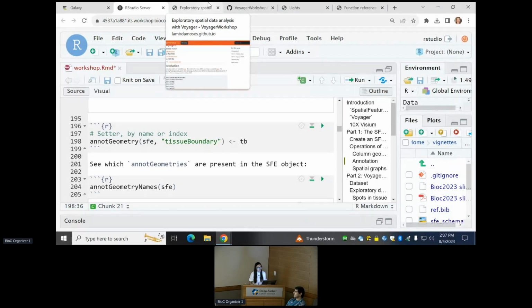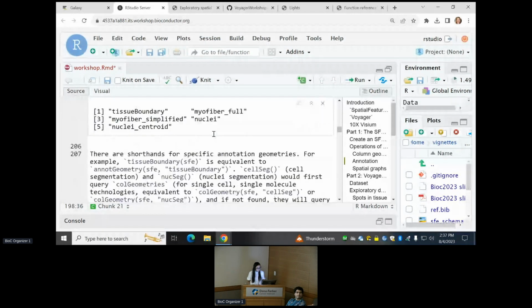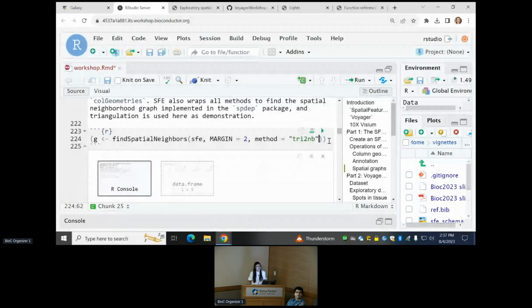Okay, so then when you run your graph thing, yeah. So can't you set sample ID? You can set sample ID. You can set which one or all. So if it's all, then the same graph finding algorithm will be applied to all the samples. Okay.